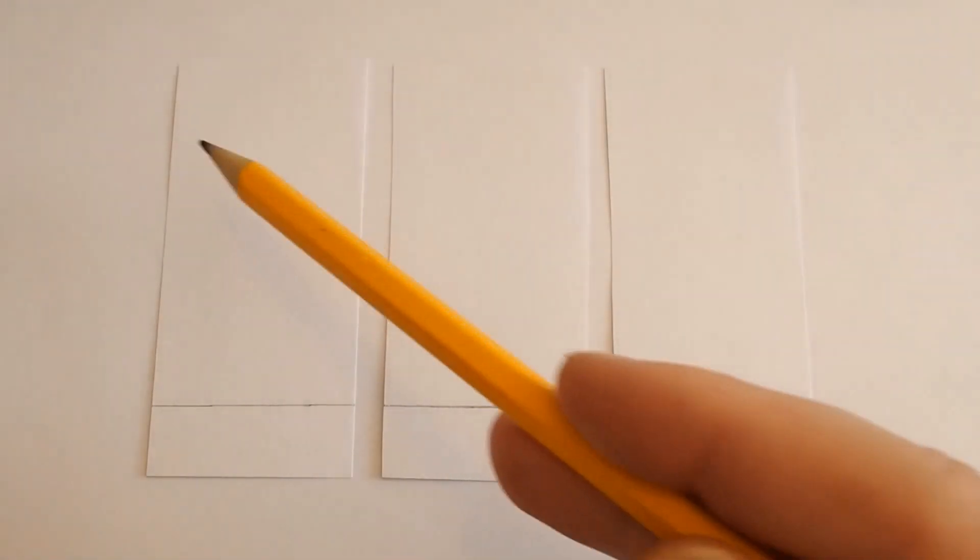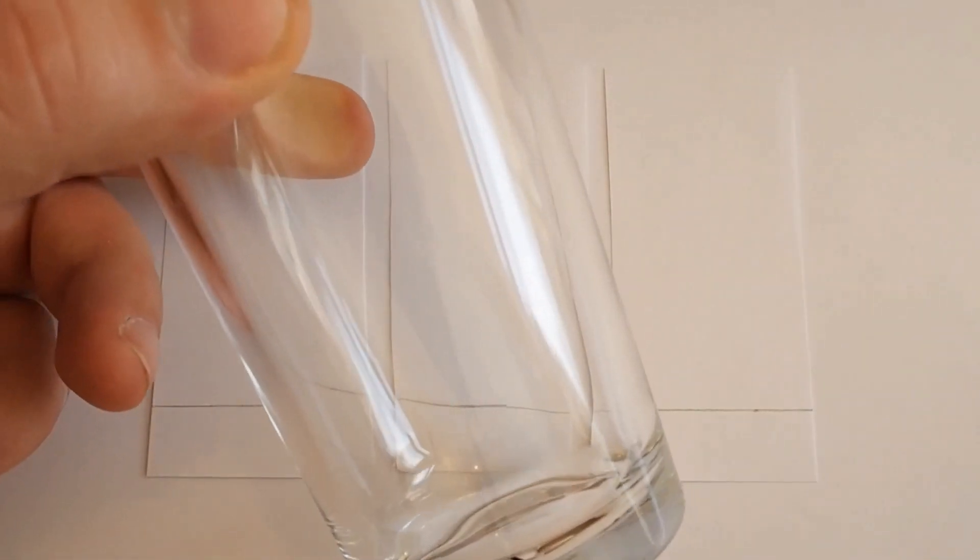Now firstly, we want a little piece of paper that is a nice rectangle and I've done a ruler line along here because what we're going to do is put our sample, our mixtures on this line and then we're going to place it in a glass just like this one with a little bit of solvent, a little bit of liquid at the bottom.